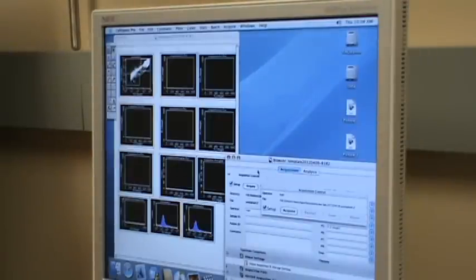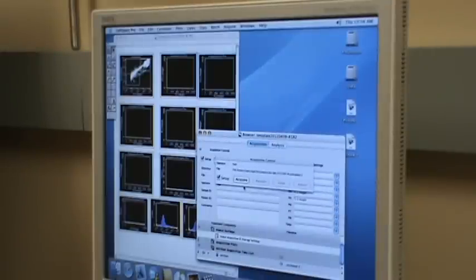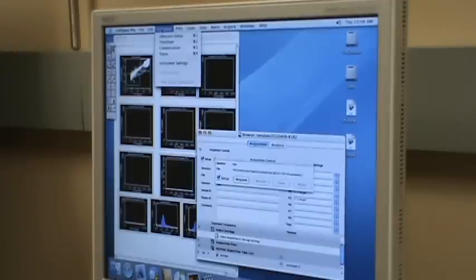Yes. Then you will see a browser, say Acquisition. In fact, you can use a cytometer now, but we often load instrument setting. Each channel has different voltage level. Different voltage level will detect the signal strength and position. So if you run one experiment today and tomorrow you run an experiment under different conditions, then the result will not be comparable. So you want to do one experiment in the same instrument setting.